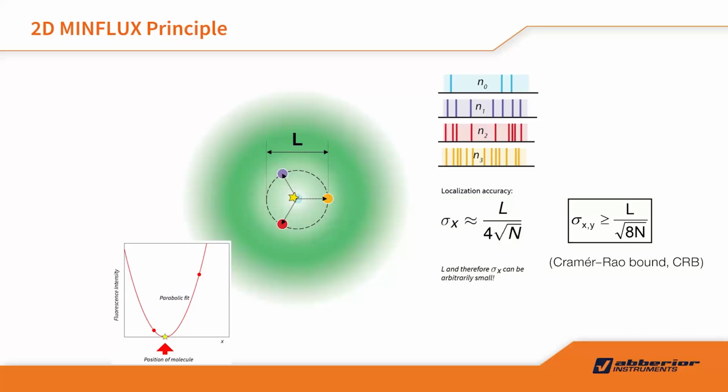And in the first paper, you see the donut was moved 4 times, right? 3 positions and 1 original position. One cycle of this movement is around 100 microseconds. So actually, it's very fast. One cycle, 100 microseconds, you can already get a localization precision. And then if you see the formula, you see there are actually 2 parts. One is the signal photon, one is the L.